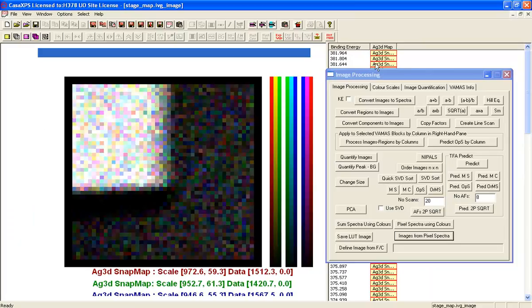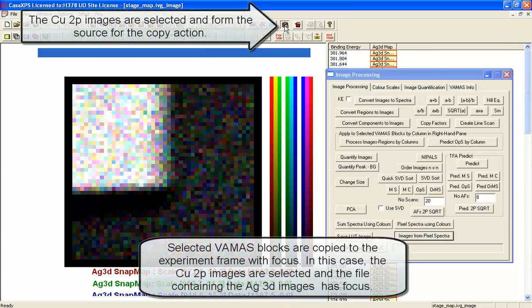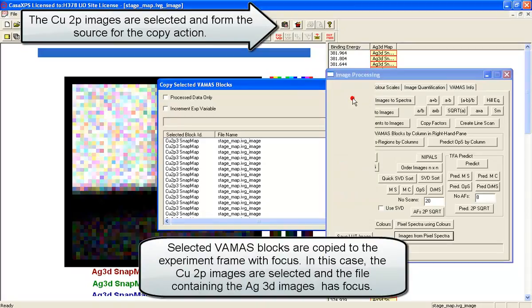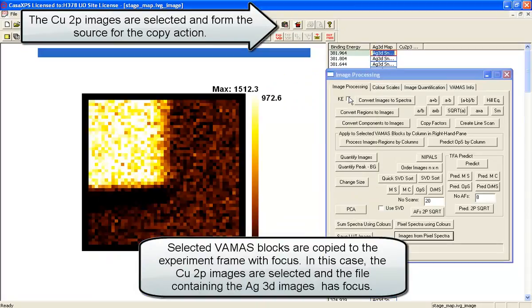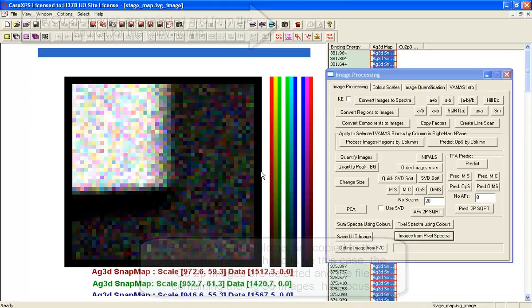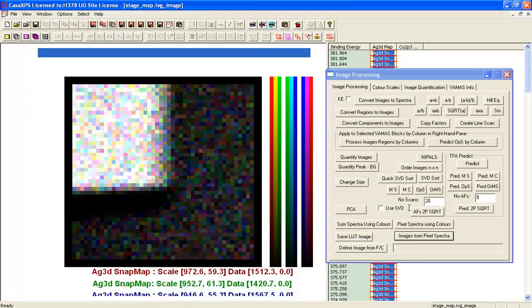Having moved to the file that contains the silver, I can now copy the copper images so we can now perform some image processing prior to looking at the spectra.